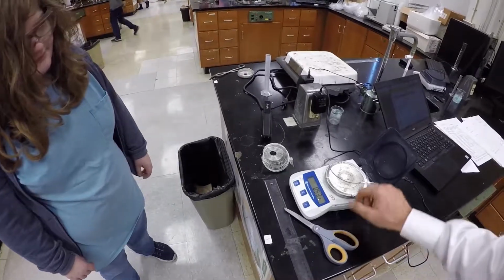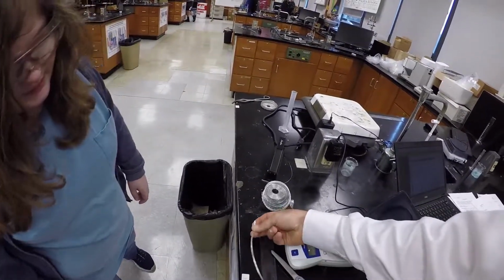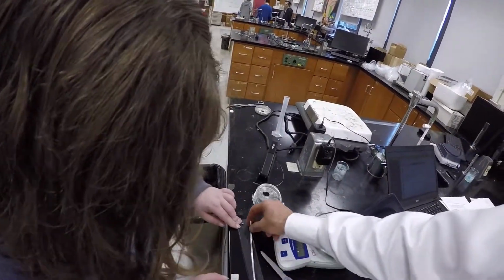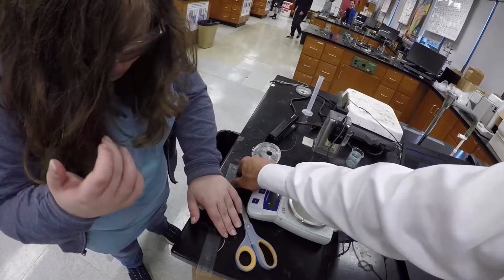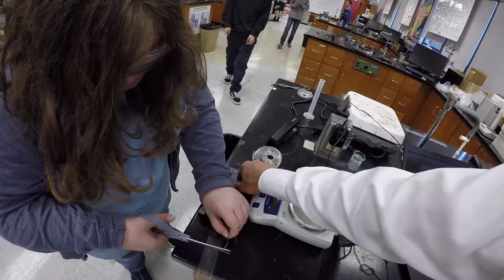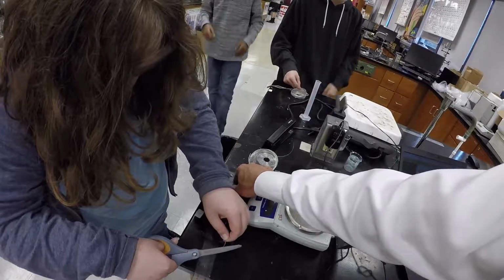Here are scissors that you can cut your magnesium with. The magnesium's in a strip, and you just measure it out here. You can see the centimeters is 0 to 25. Just hold that out. Is it 25? It's a little bit more. Cut a little bit of that off. Looks good.